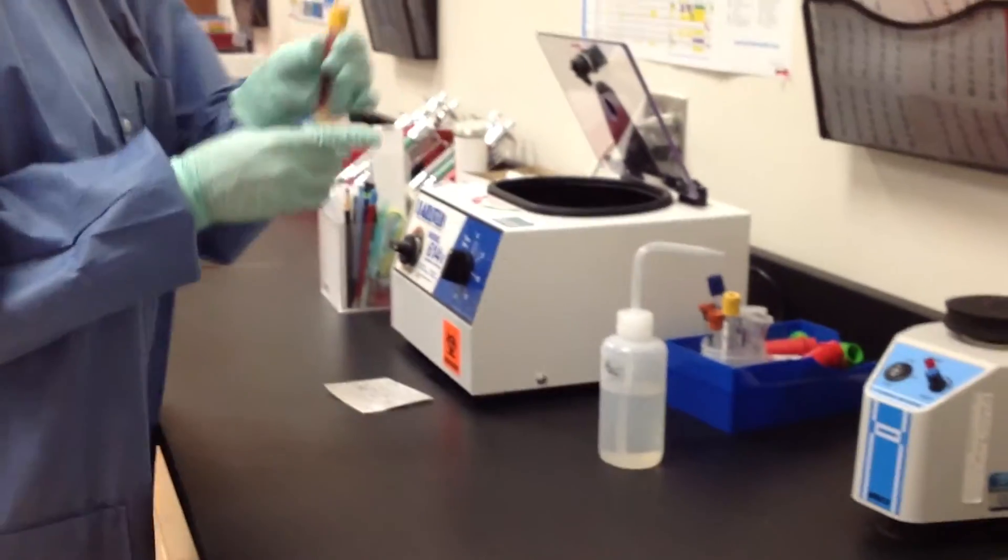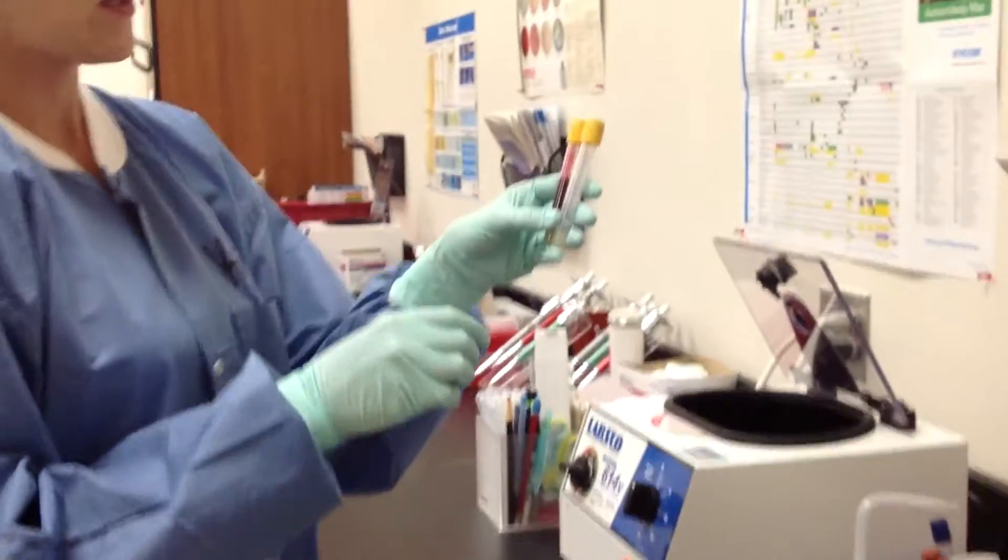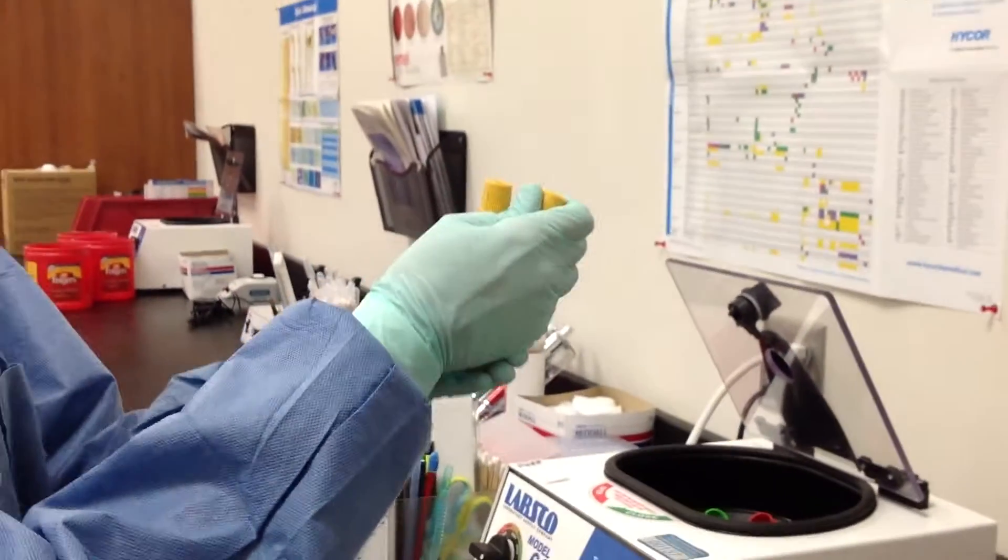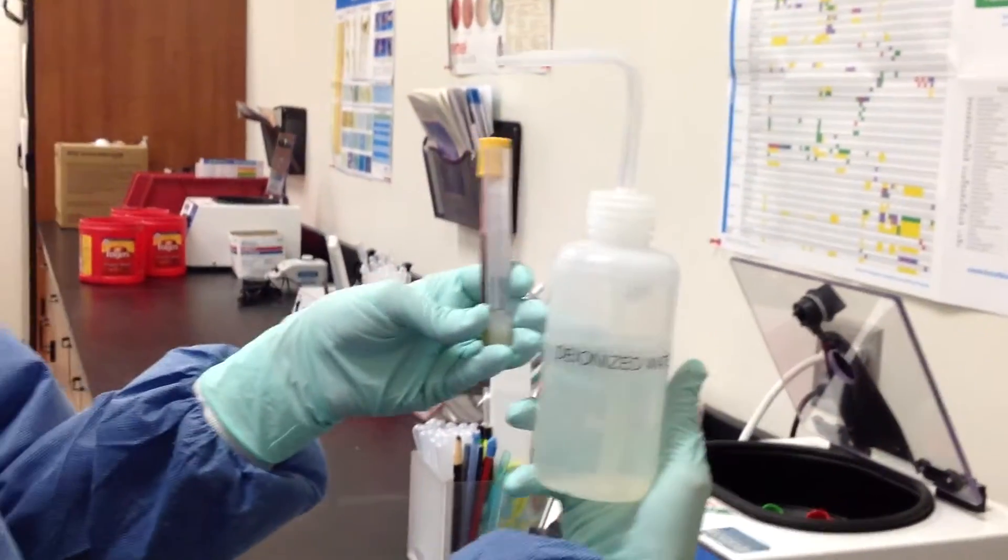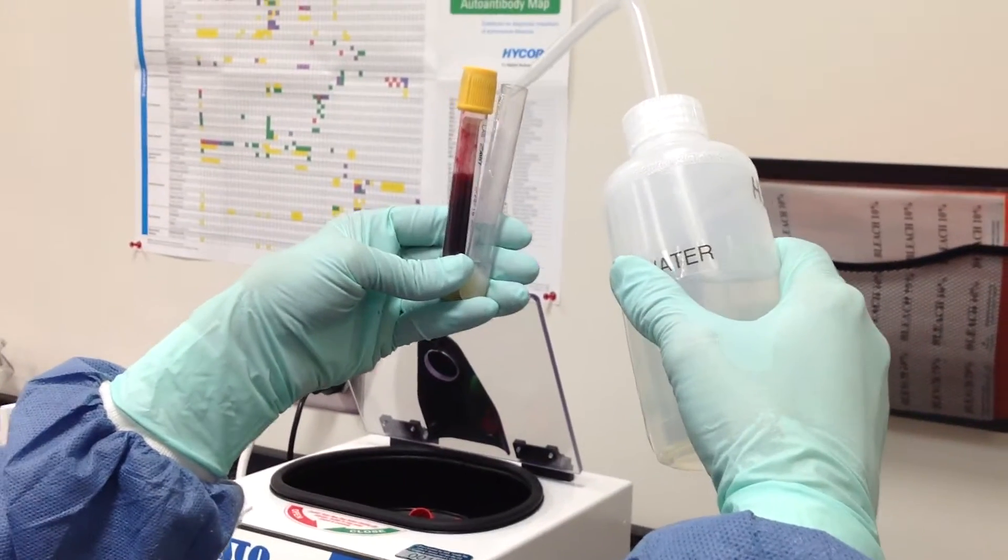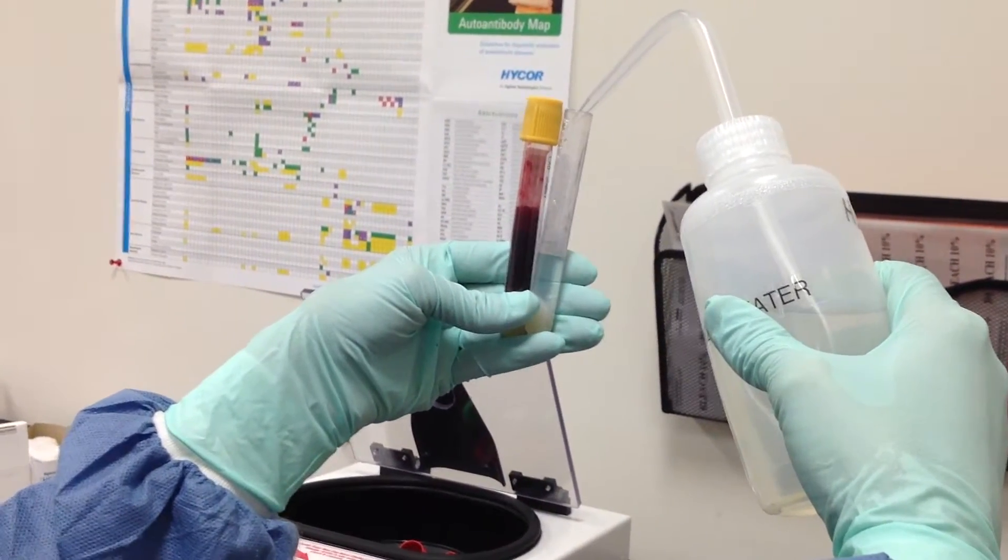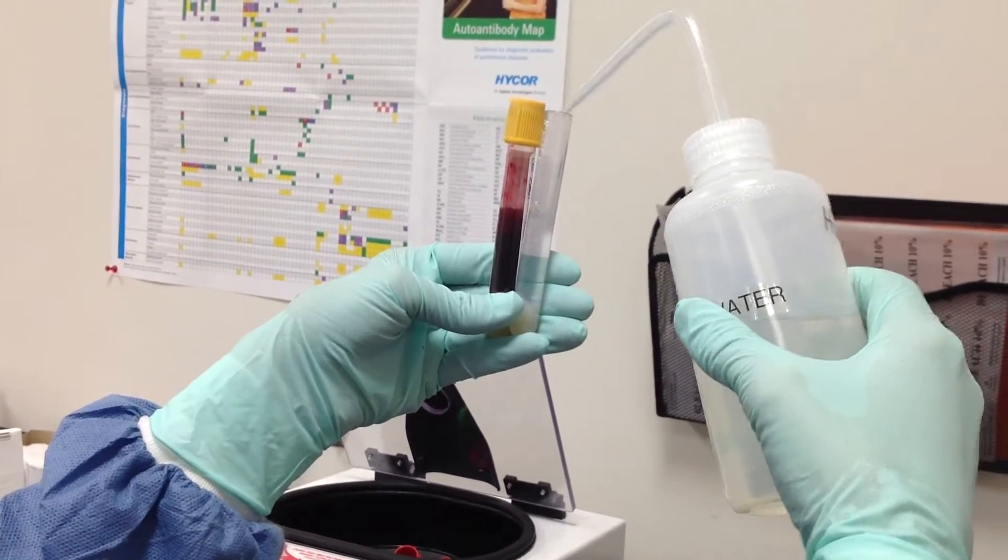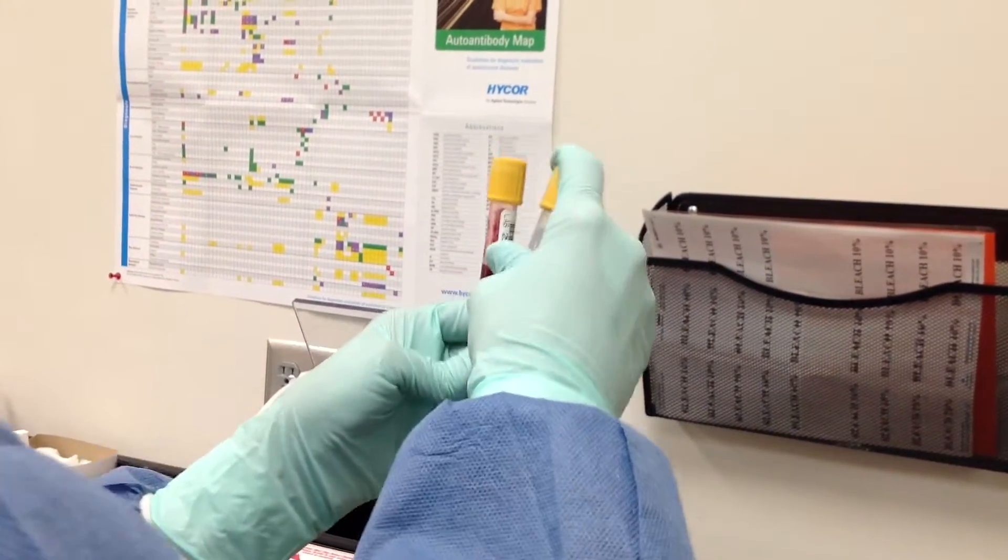Our next step is to centrifuge it. We need our balance tube, and it's too low, so in order to balance it, we take our water and fill up our balance tube to match the blood. Once it's matched, put your lid back on.